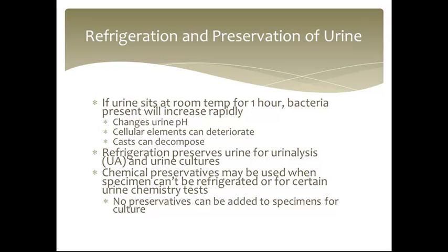And 24-hour preservatives are added prior to the start of collection. So if you're doing a 24-hour urine, that has to be added before you give the container to the patient.